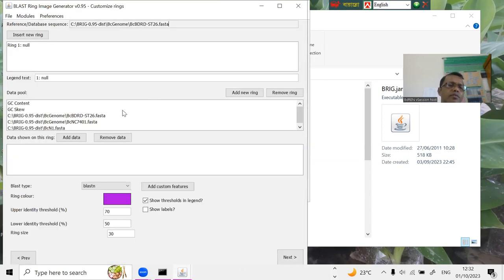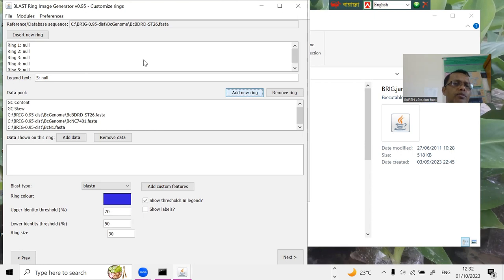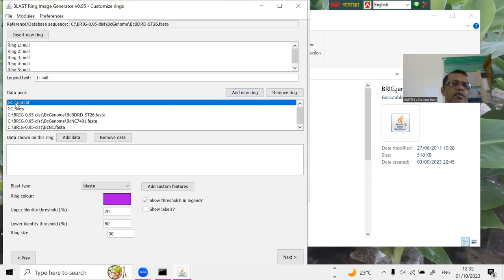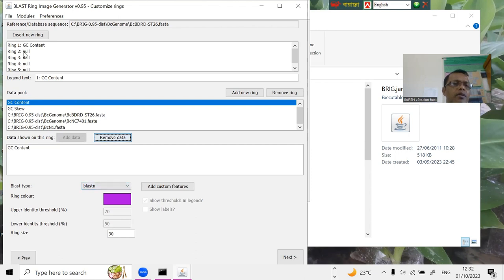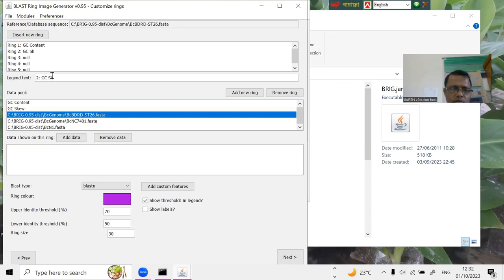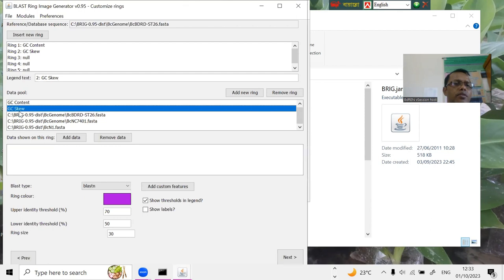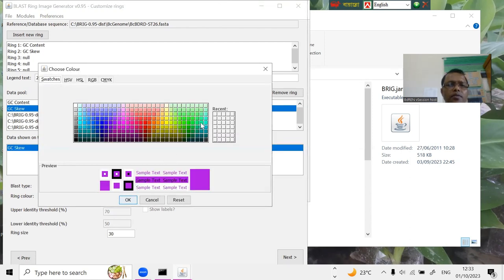Okay, so, how many you have, say, please add ring, one, two, three, okay, four. So, one is the GC content, right? So, click here, this one, you can write GC content, GC content, and add to the data. So, this is the purple color, pink color, okay. Then, number two, this is the GC skew, write GC skew. So, this one, GC skew. So, here, the GC skew, add to the data. Okay, they change the color, you can see this one color, okay.